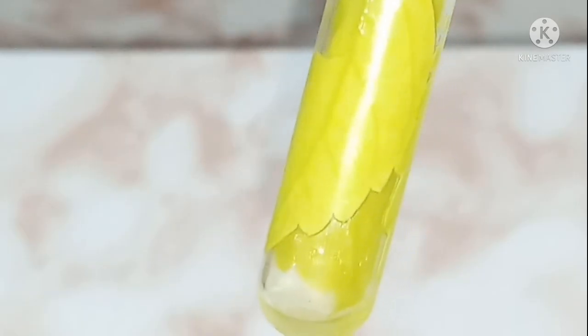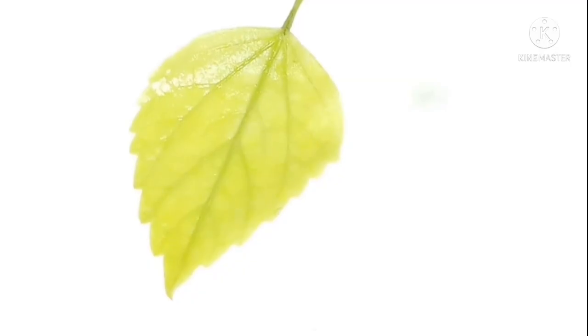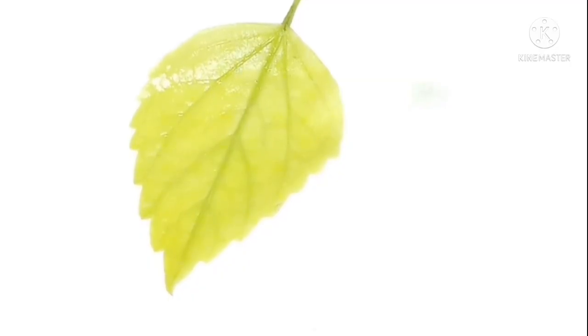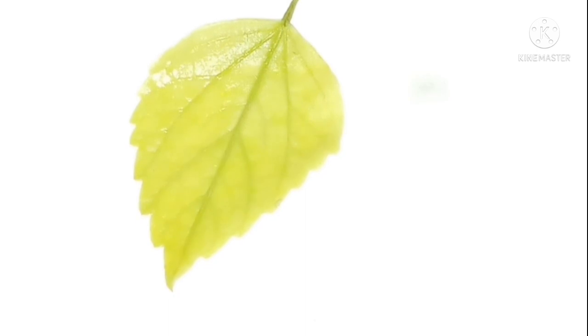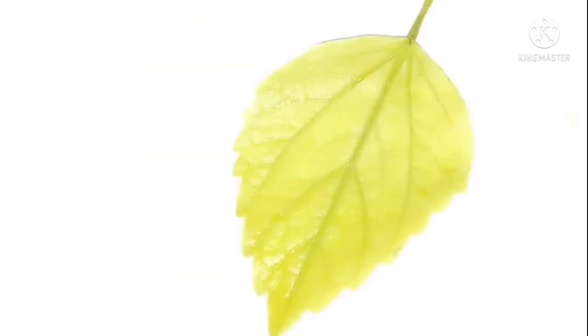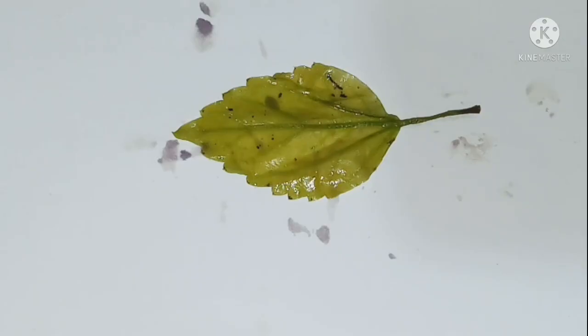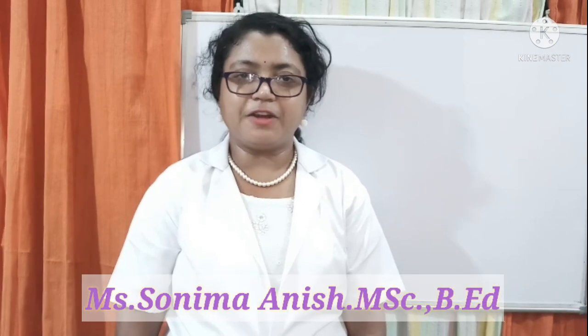Boiling in alcohol will remove the chlorophyll content from the leaf. After boiling in alcohol, wash the leaf with water and place it on a white sheet. Now pour the iodine solution to check the color change. You can observe a color change on the leaf, and it has transferred to the paper as well.